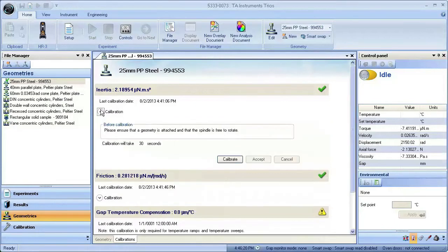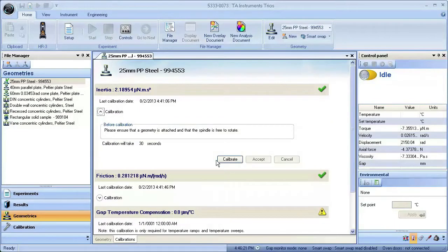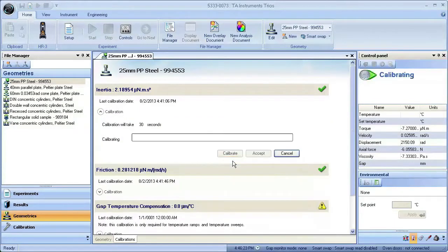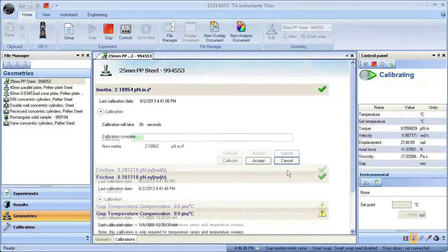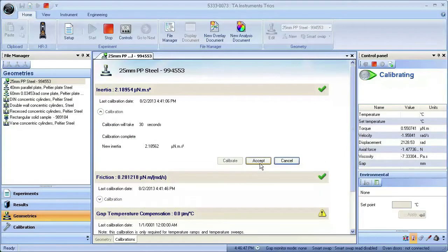Expand the inertia calibration and press Calibrate. Accept the calibration parameters and move on to the next calibration.